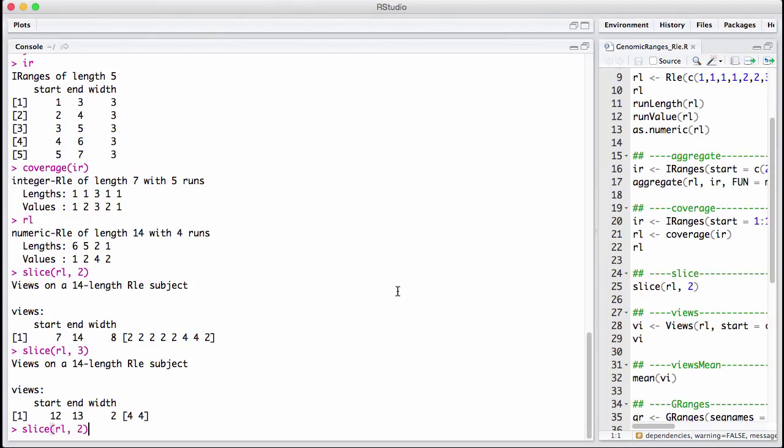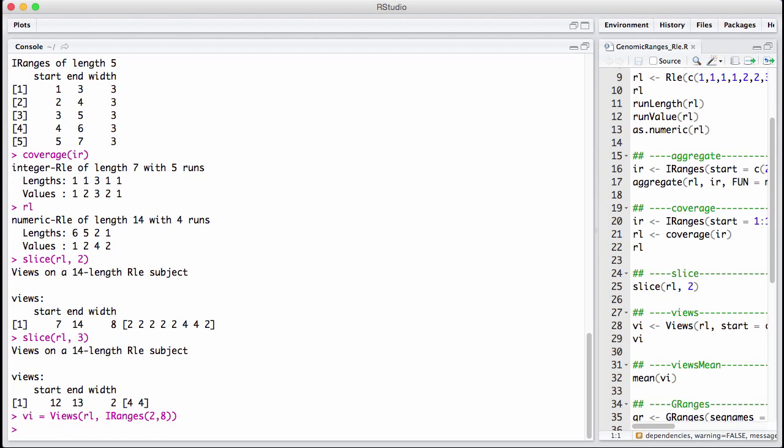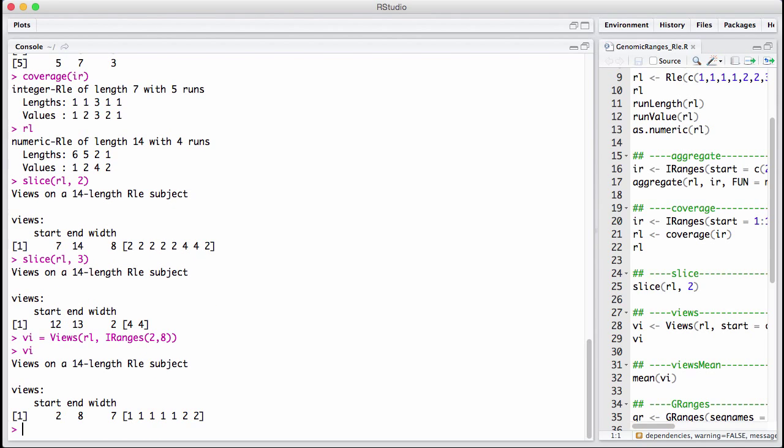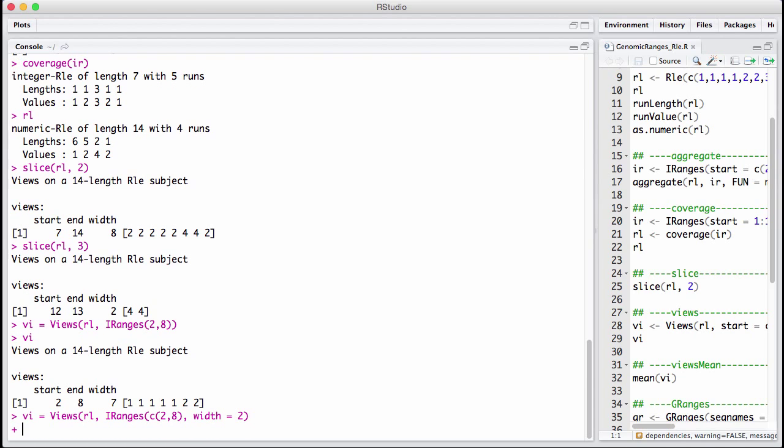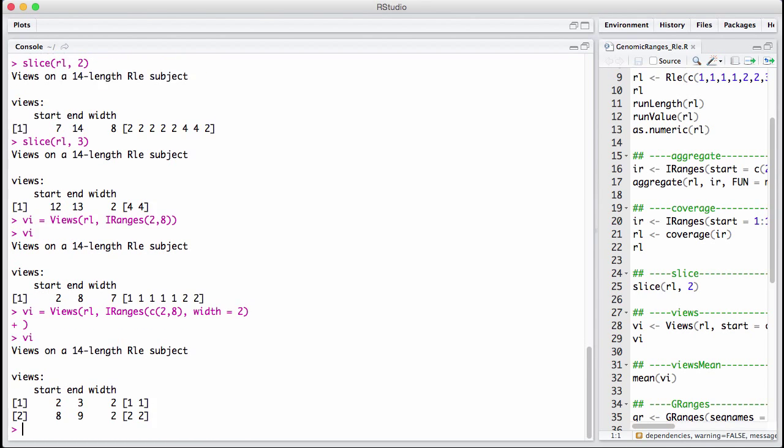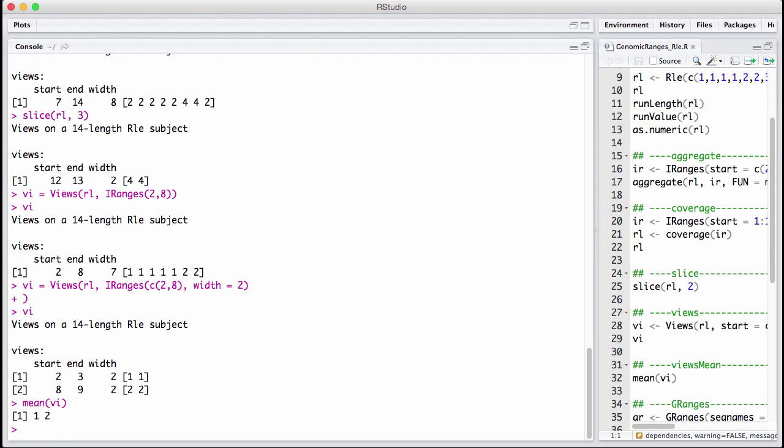We can instantiate our own views, of course. And once we have a view, or we have a set of views, let's make a set of views. We can compute functions on these views here. So for example, let's say we just want to take the mean of the view. And this is basically the same as what we did with the aggregate example above.